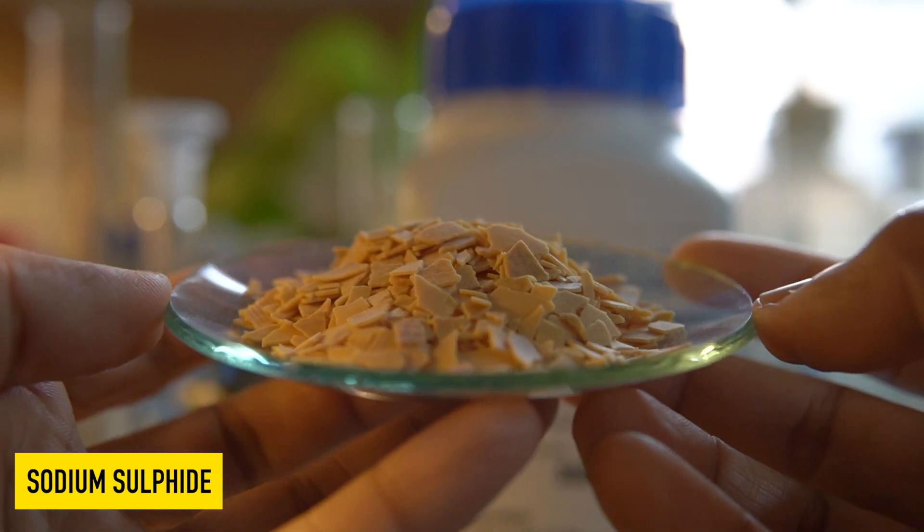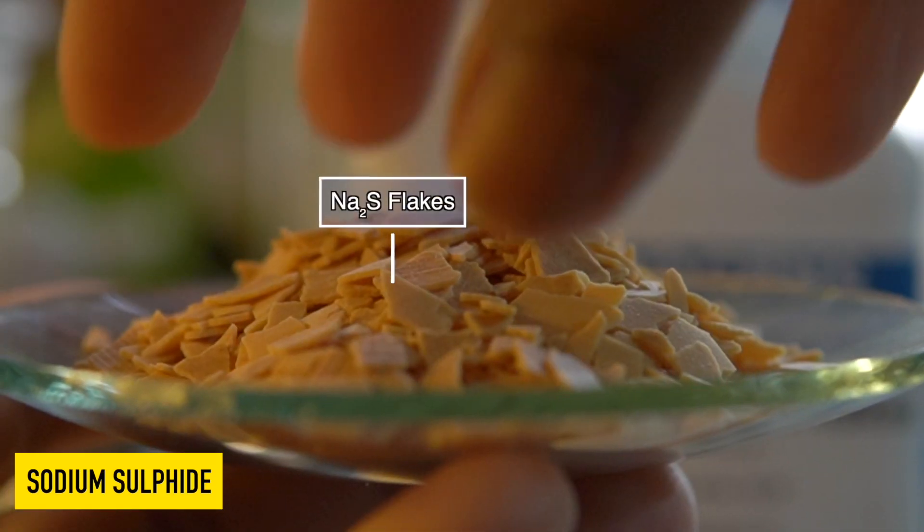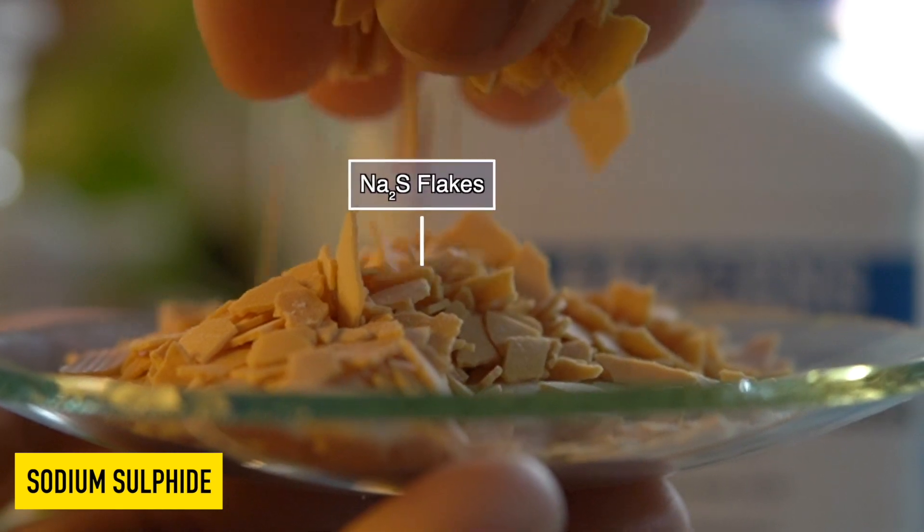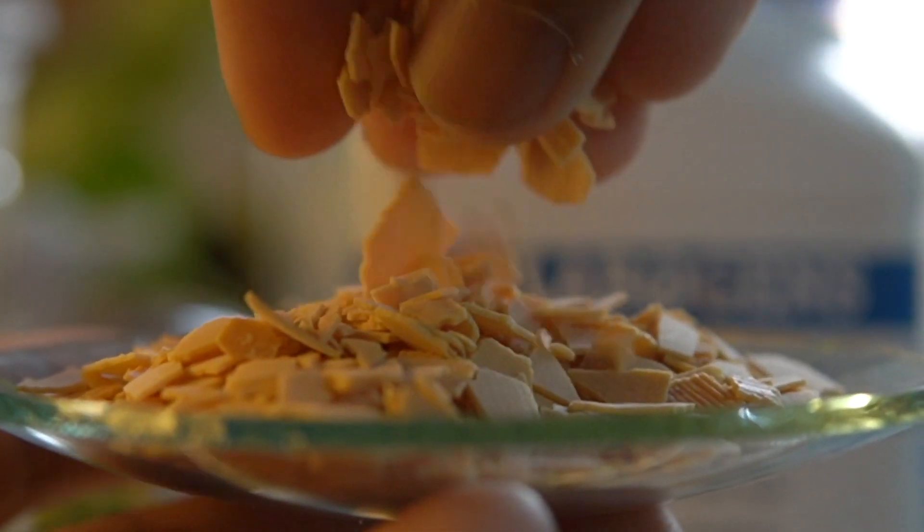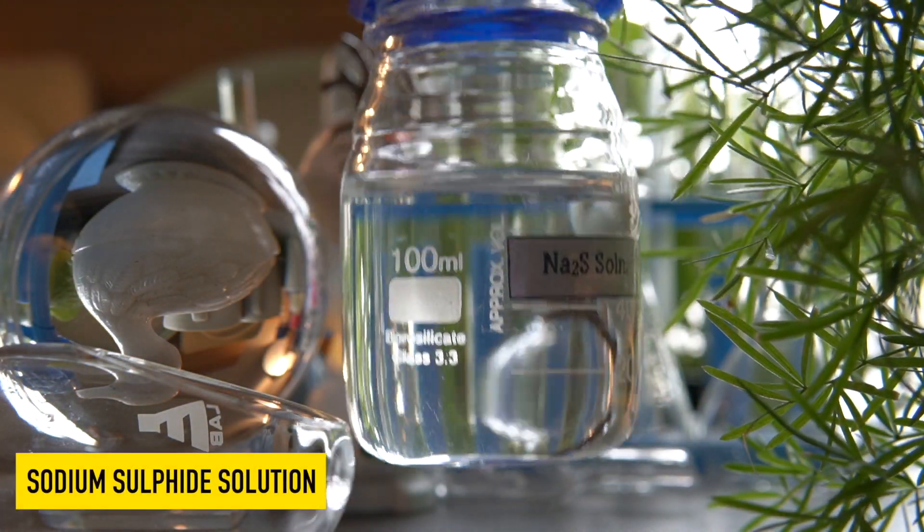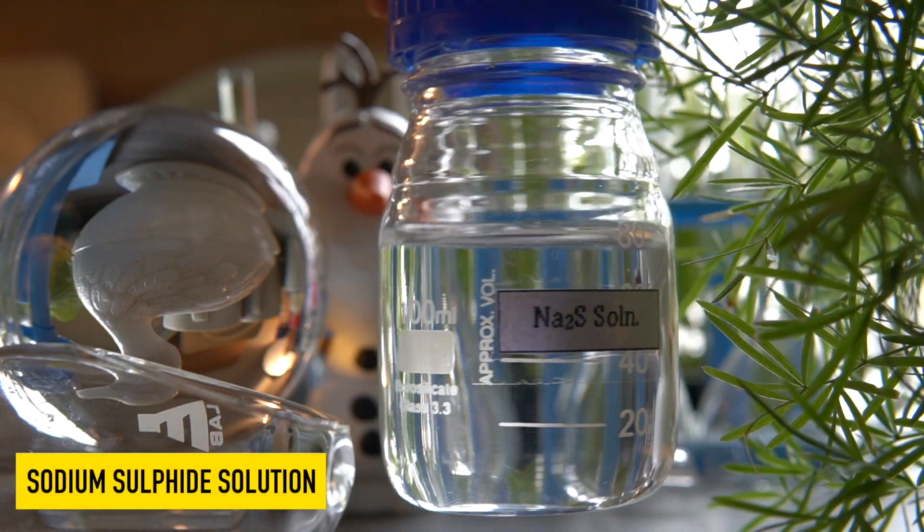These are sodium sulphide flakes. They are slightly yellowish in colour and highly soluble in water. They can easily dissolve in water to make a clear colourless solution.